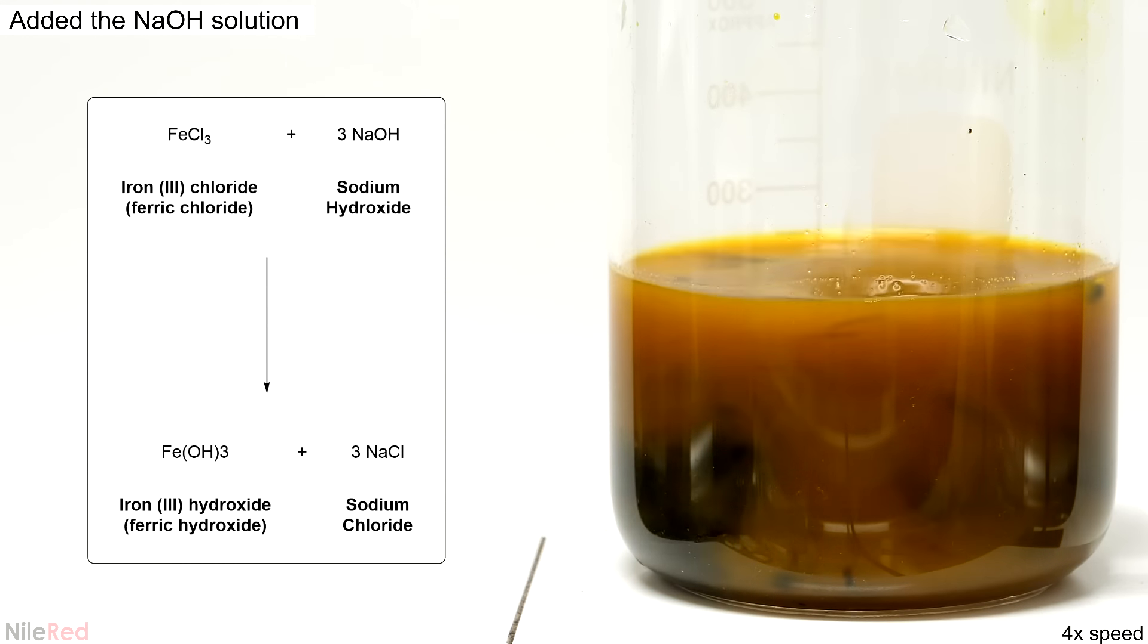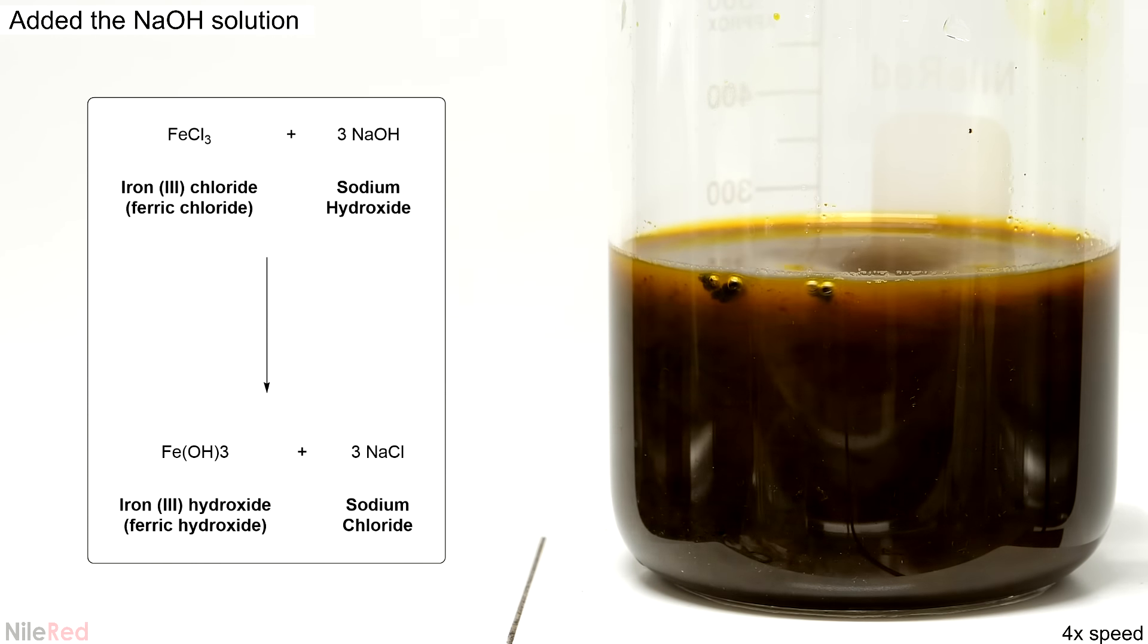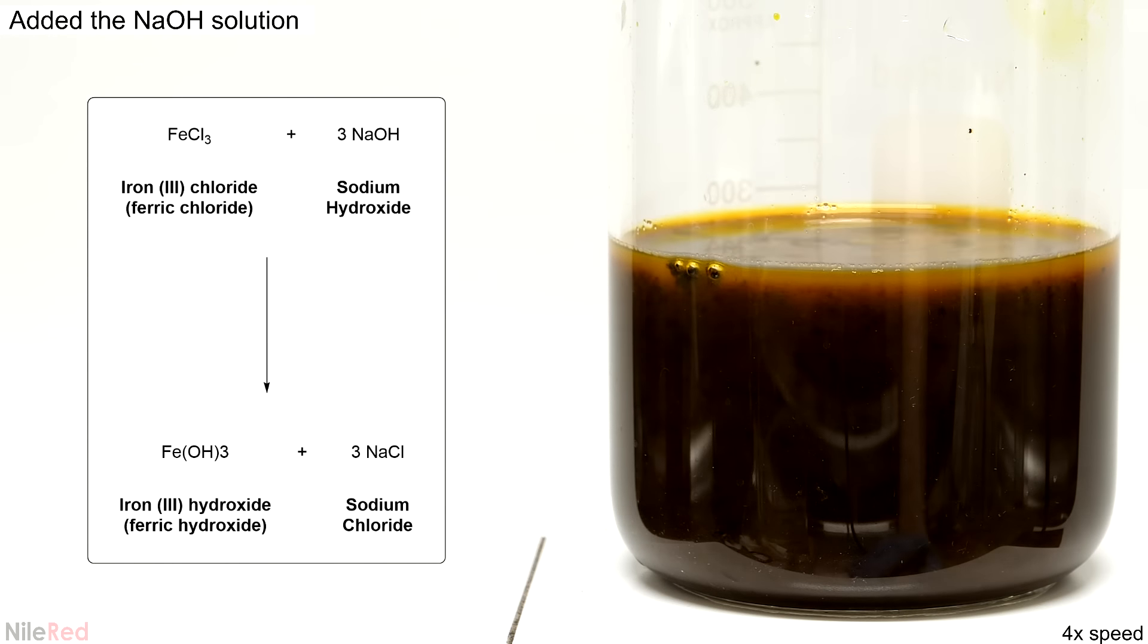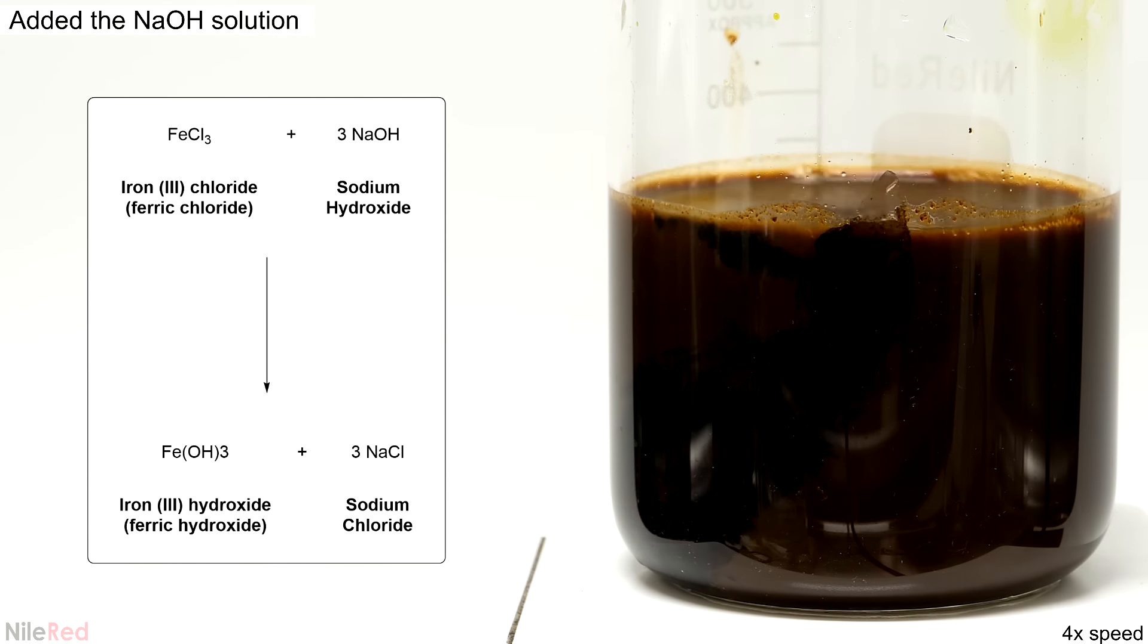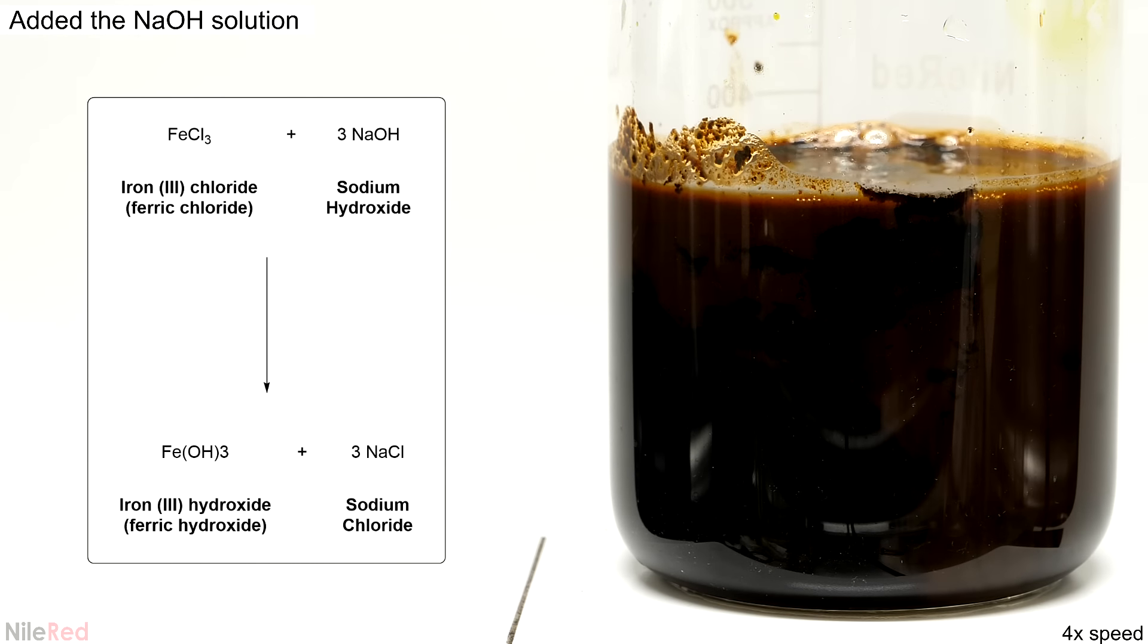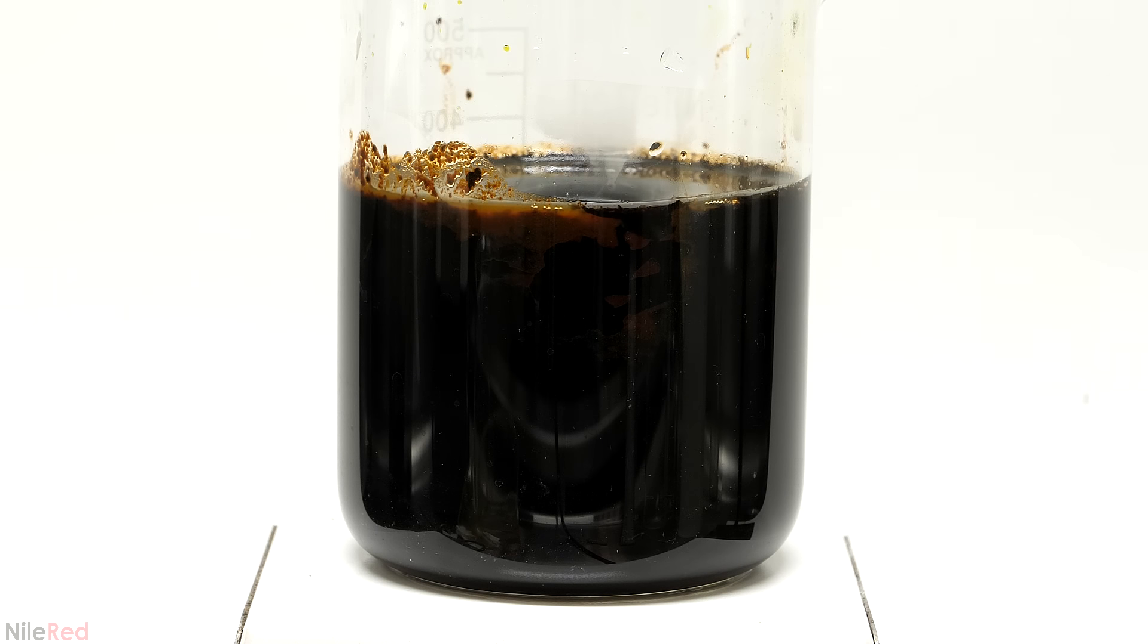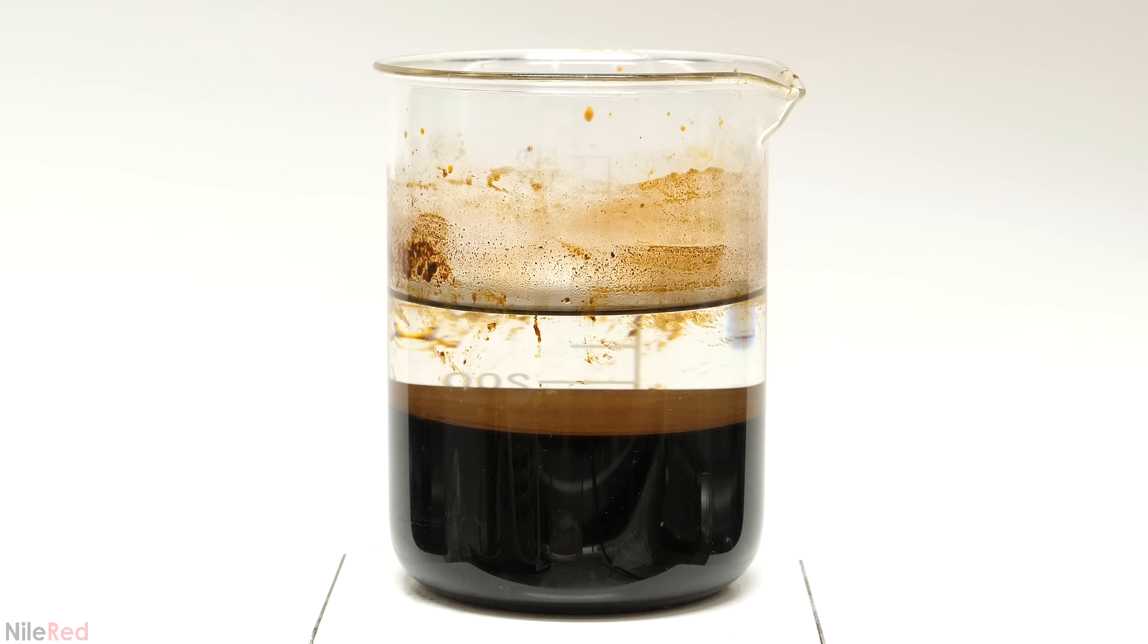So I just moved on to the next step, which was to react it with the sodium hydroxide solution that I made a couple minutes ago. I added it slowly over the course of about a minute and a lot of dark iron three hydroxide formed. This form of iron was practically insoluble in water, so it immediately precipitated out. As a side product this reaction also made sodium chloride, but that just stayed dissolved in solution. I continued stirring it for about an hour and then I let it sit overnight.